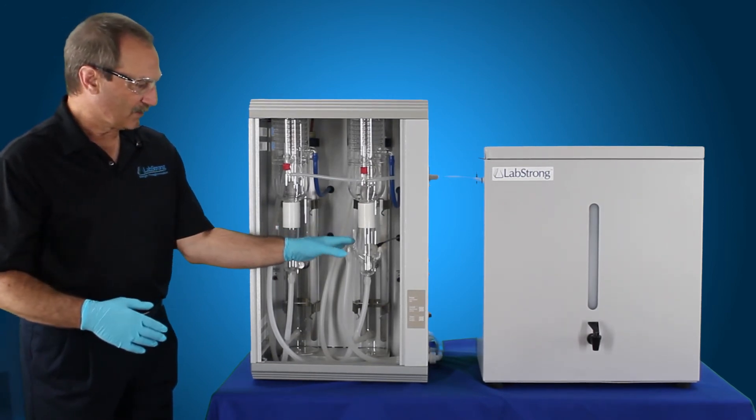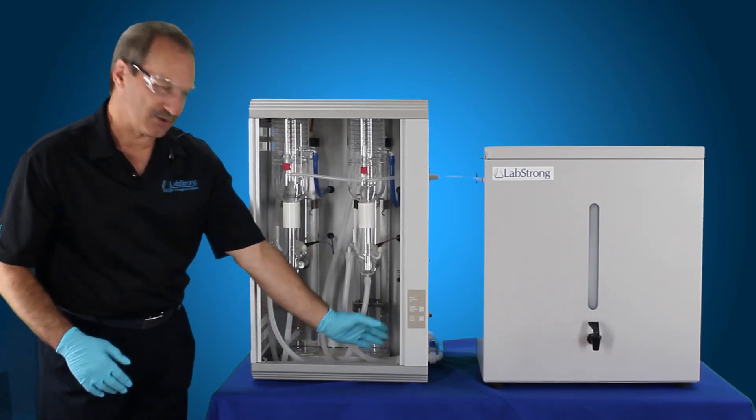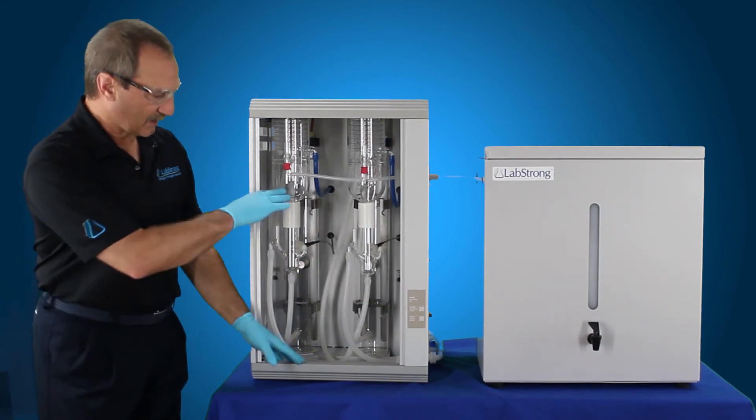Then that will go ahead and hit the thermistors at that point, shuts it off, shuts the inlet off, and then it lets it drain back out again. And that's your second flush. So it flushes it twice after you've hit the clean button to let the solution go out.